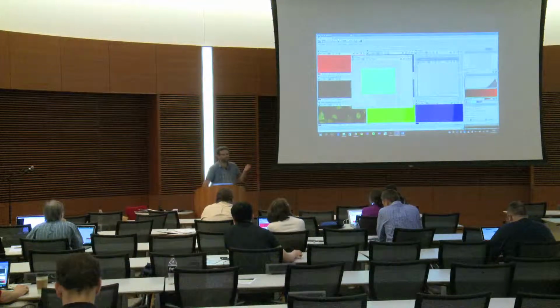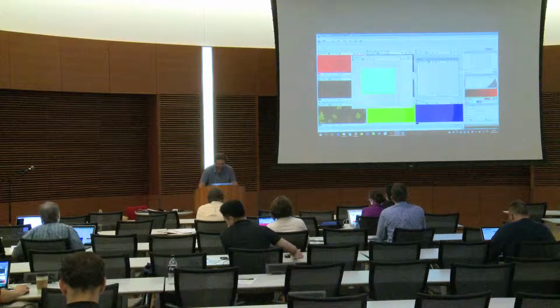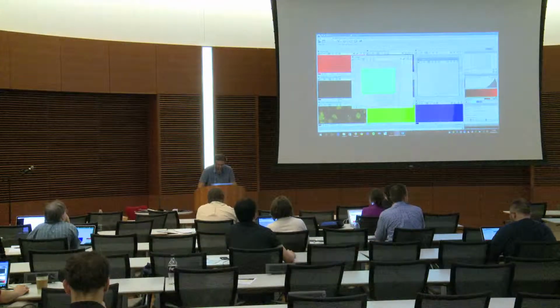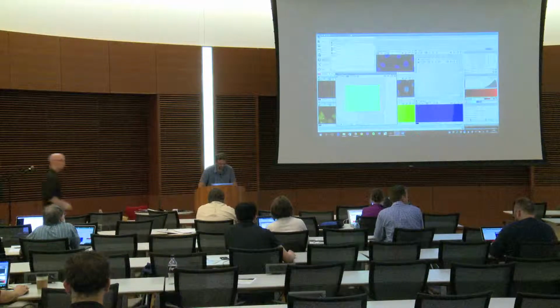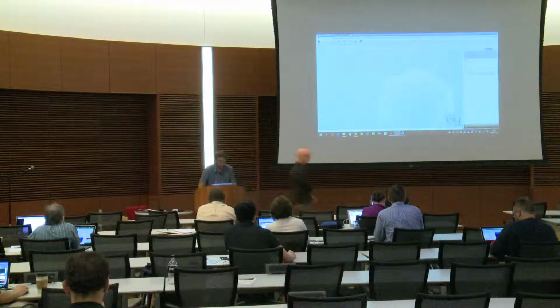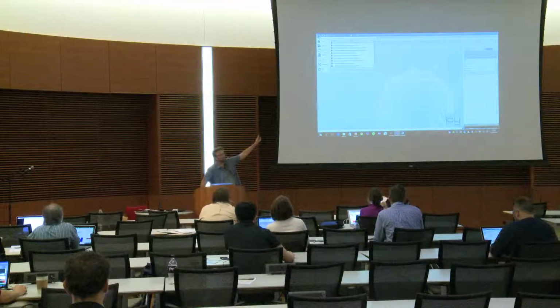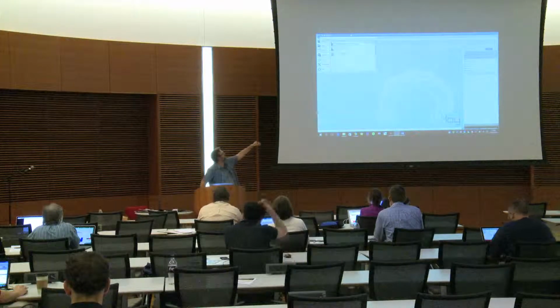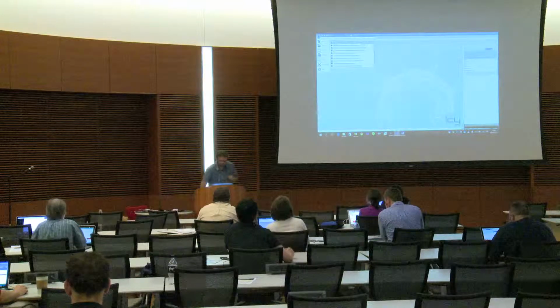Okay, so now I'd like to show you some extra stuff that we have. It's possible when you are playing with an image. So here you can close everything, and this button, for the Mac user, maybe you are not used to it. It is the application button. You have the same on the Mac, and here you can open back the images that you just opened.